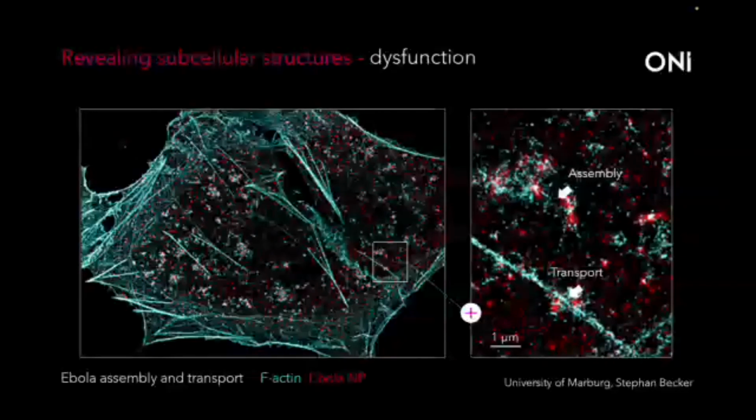There are many other examples of subcellular structures that can be informed in immunology through super resolution microscopy. But I would like to go next on to receptor clustering. Receptor clustering is really almost the ideal model for using localization microscopy, because inherently you see one molecule at a time and then you build up your image. It's absolutely perfect for looking at the nanoscale clustering behavior of various molecules.